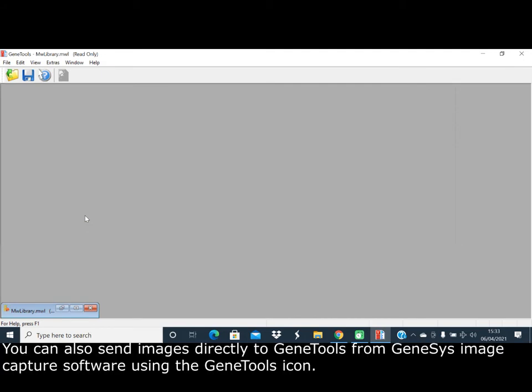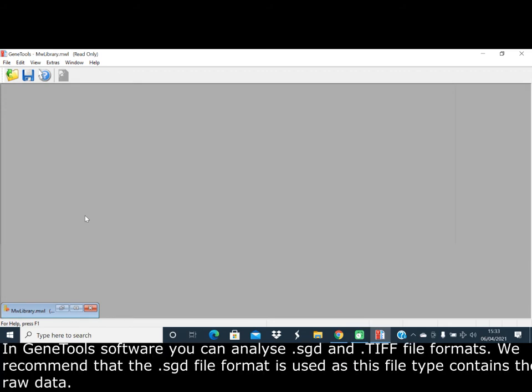You can also send images directly to GeneTools from the Genesis image capture software using the GeneTools icon.